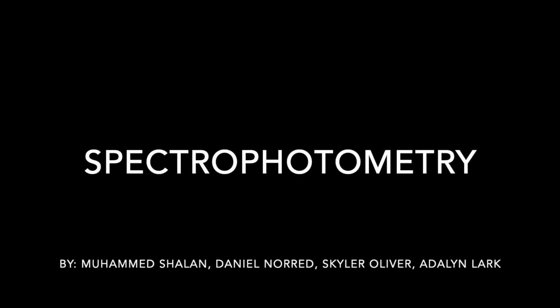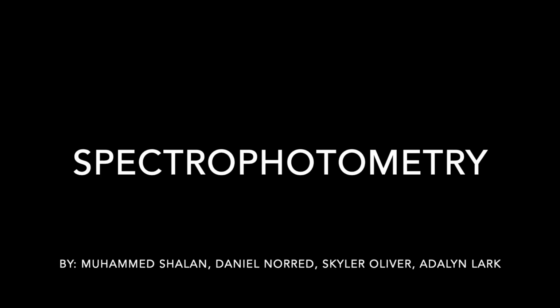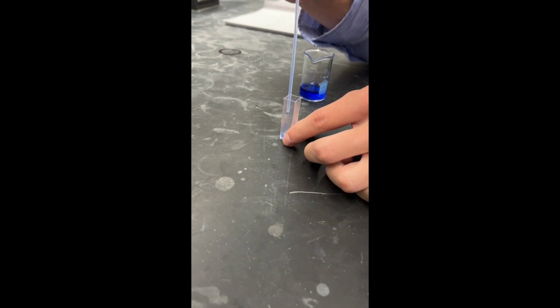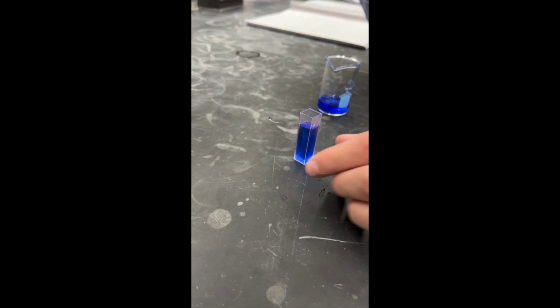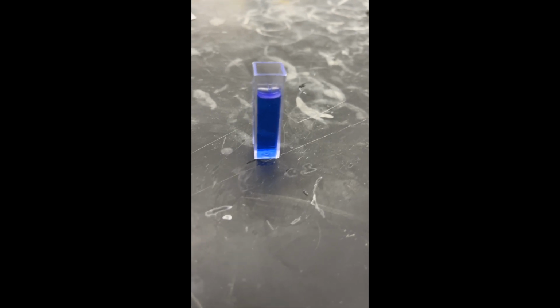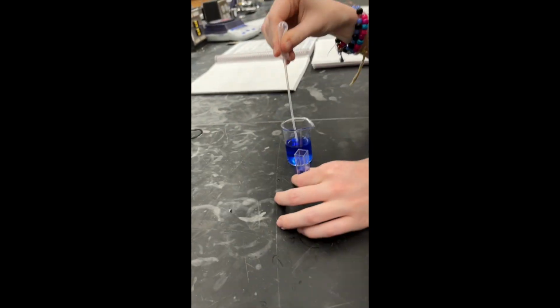Spectrophotometry. In this video, we will be demonstrating the use of a spectrophotometer. Previously, we had prepared a series of solutions using the original copper amine stock solution and 4 dilutions using the serial dilution method. After a series of dilutions, the copper amine solution will be analyzed using a spectrophotometer.